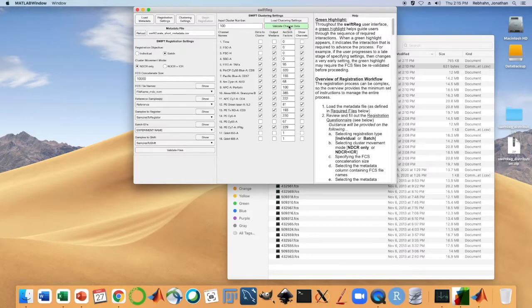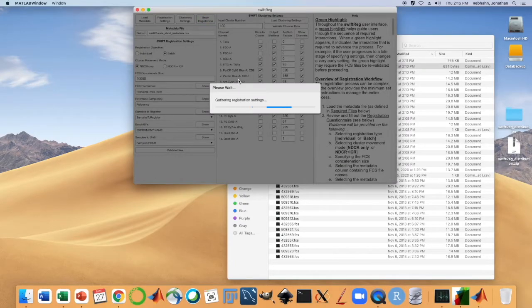data. When it validates channel data, it's looking for singular values throughout a channel. It looks for correlations, like very high correlations between channels, and it looks for missing values in channels. And if it finds any of those problems, it will let you know and give you some suggestions of how to proceed. And then once that's done its checking, we can begin the registration.